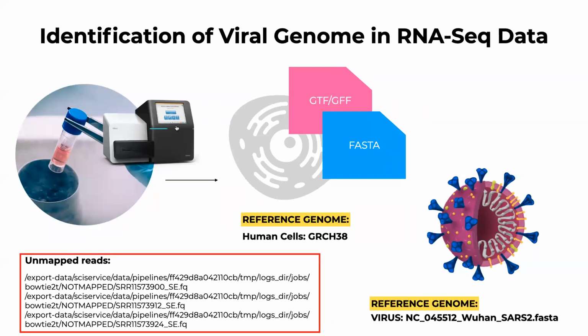And when we have the sequencing, for example, RNA-seq sequencing, when we measure expression of genes present in the sample, we're typically going to take genes from a reference genome. So for example, if these were human cells, which we'll talk a little bit more about with the bioproject and what these data sets are, to understand what kind of genome to use and why we're doing what we're doing. So we take some sample, we look for genes expressed from the human genome. We have here the human genome already on the platform.